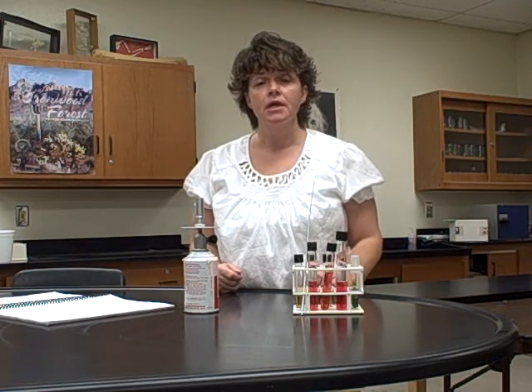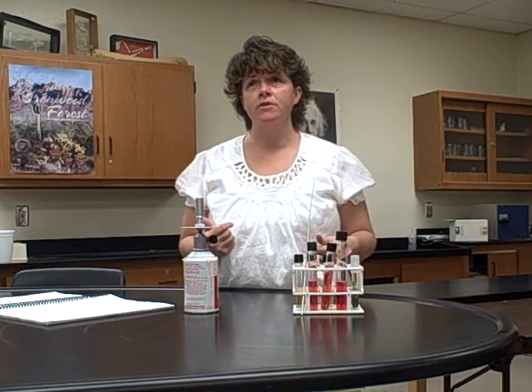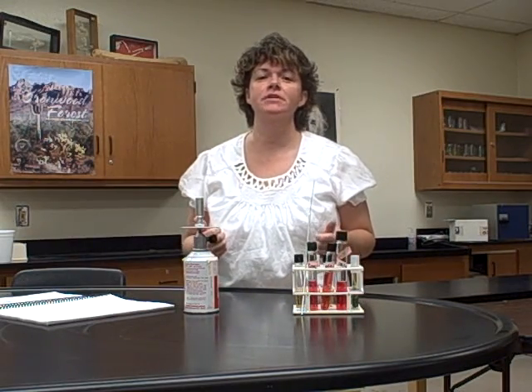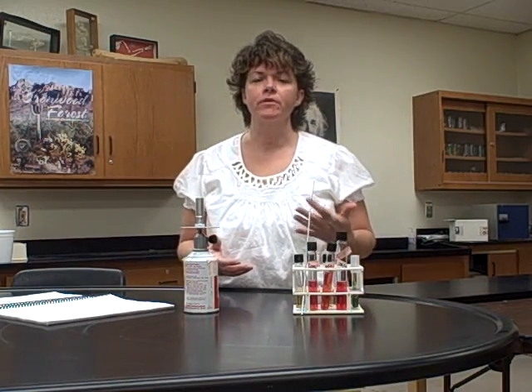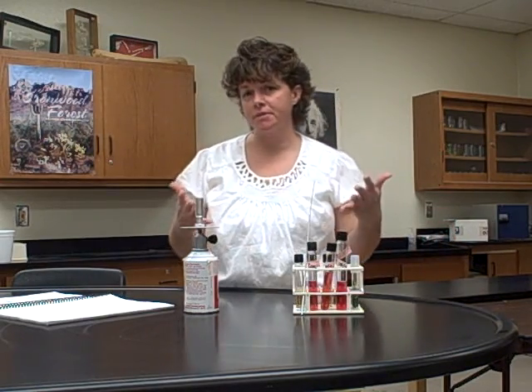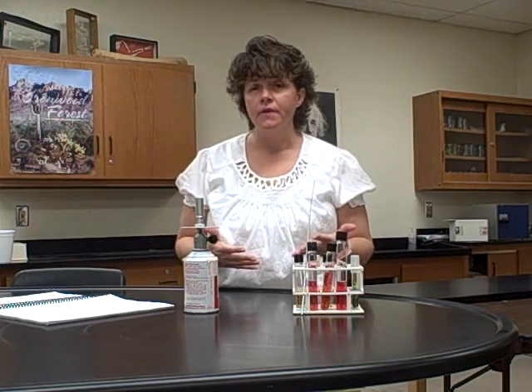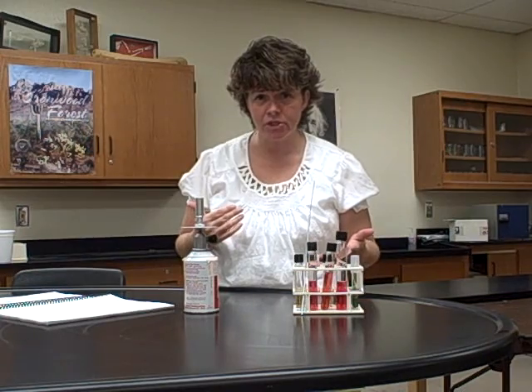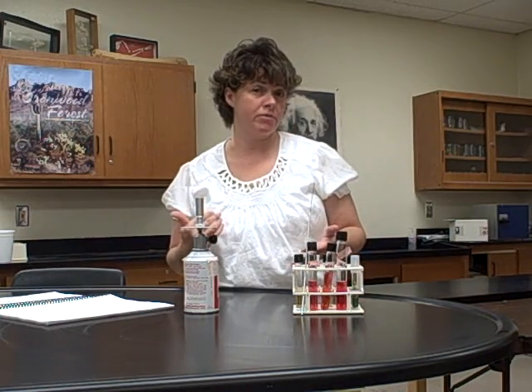Okay, this next lab is called Fermentation of Carbohydrates. What you've been learning about, I believe in chapter 5 or 6 of the textbook, is the metabolism of microbes. We know that breaking things down is called catabolism and building them together is called anabolism. In fermentation, recall that there's aerobic cellular respiration and then there's anaerobic cellular respiration.